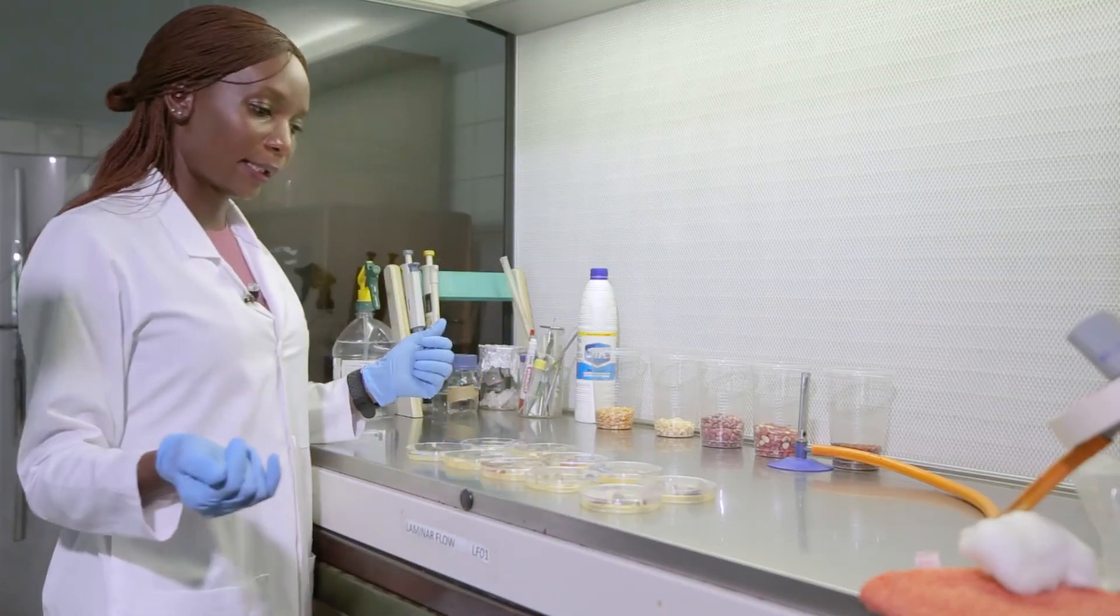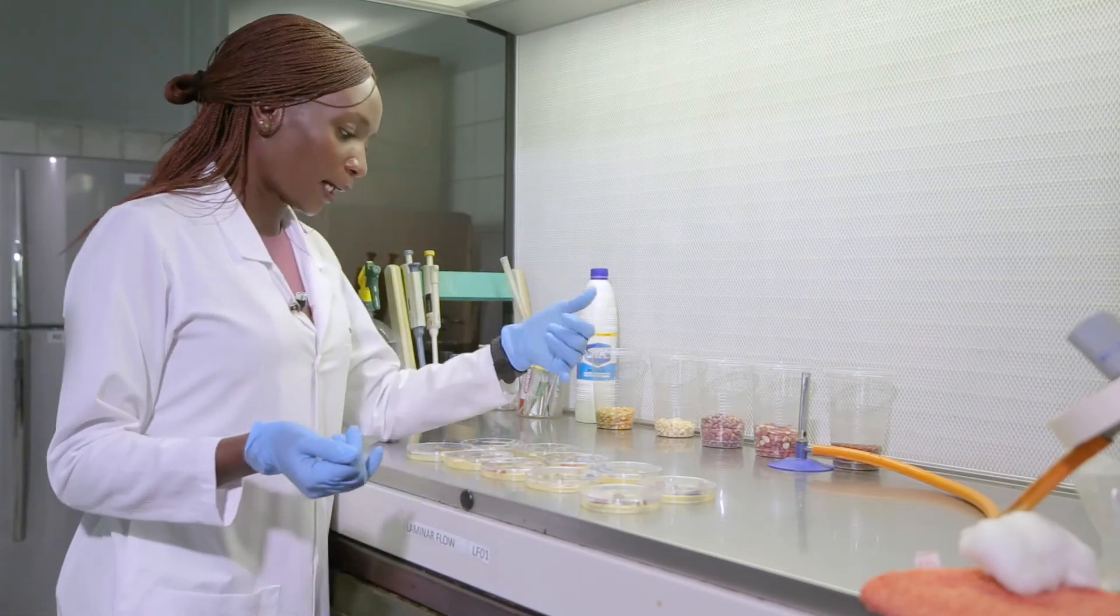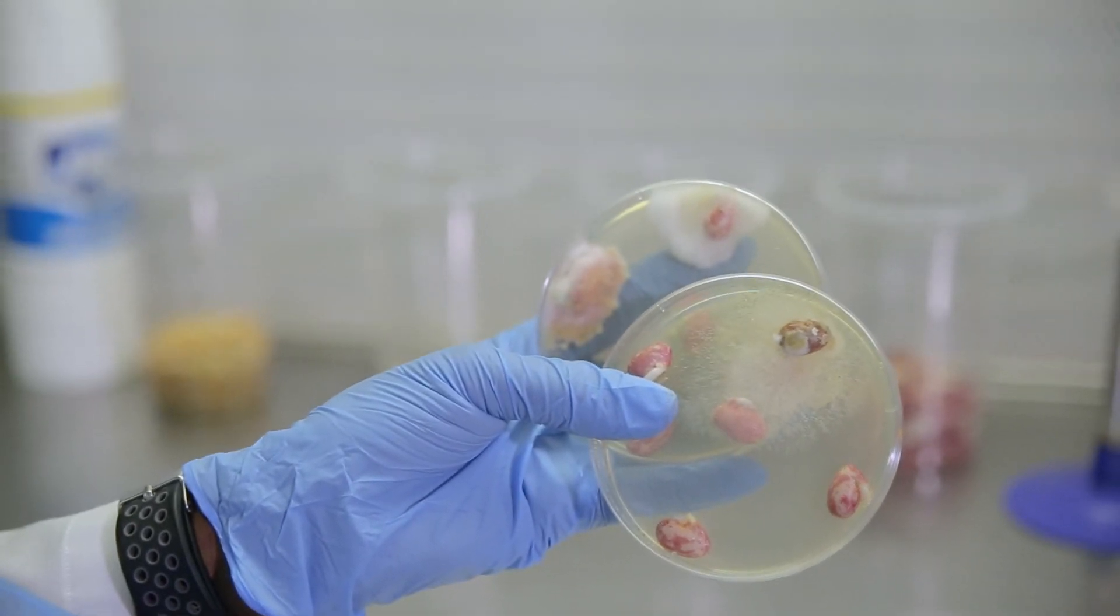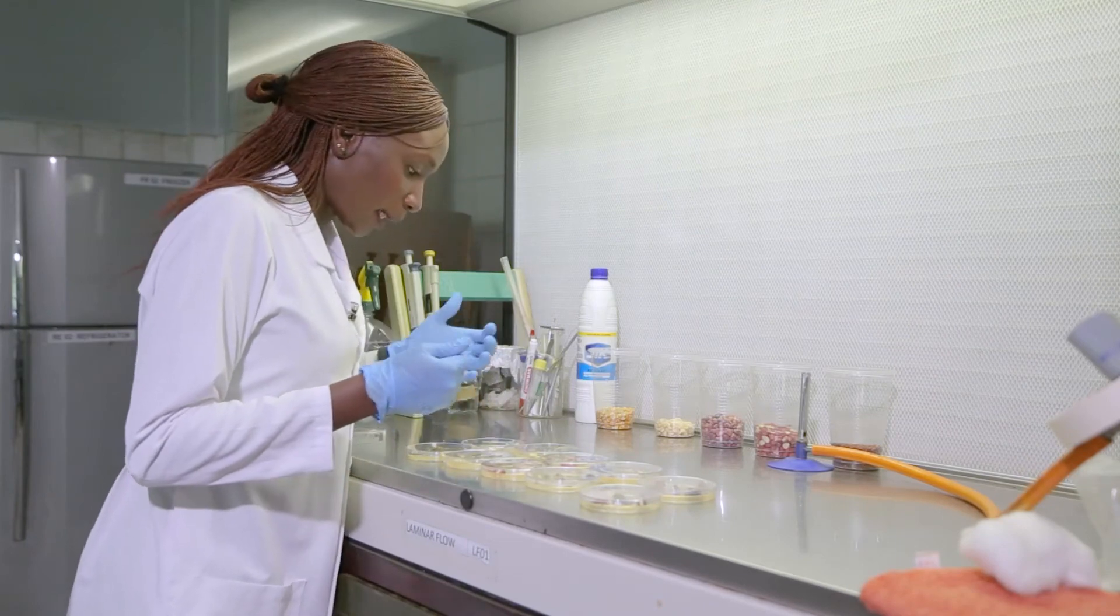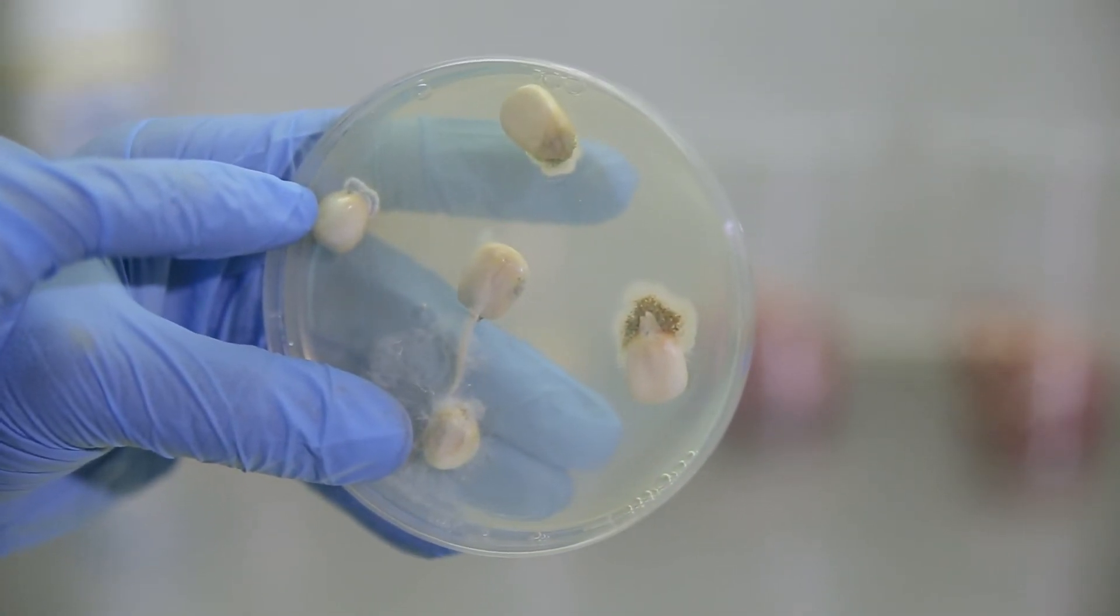The black one, I said most likely Aspergillus niger. And then we do have the white mold also, which may presumptively be Mucor or Fusarium. And then I have seen what is most likely to be Penicillium. It's that dark green mold we see in there.